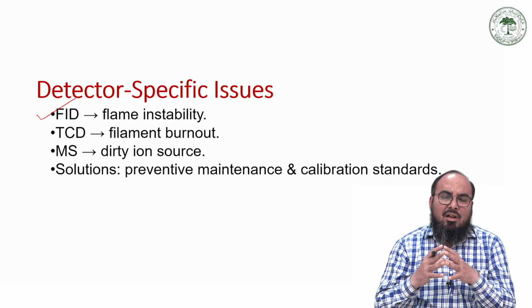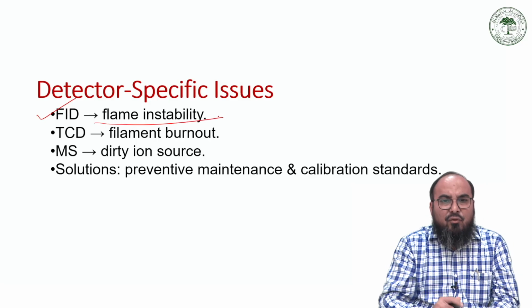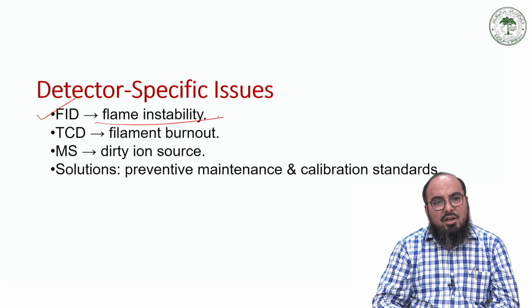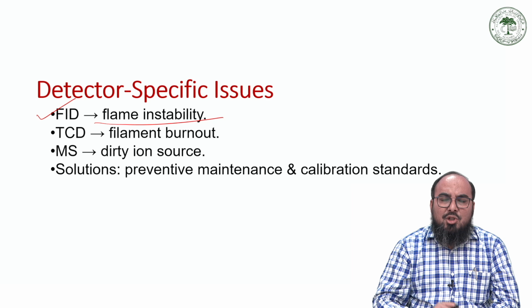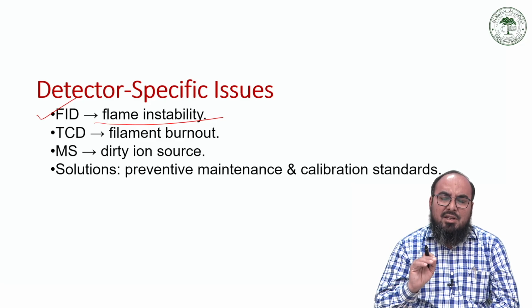Because you are using a flame, there are always chances of flame instability. So you have to make sure that your flame is maintained and lighting at the same efficiency.